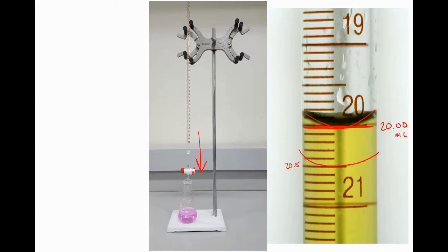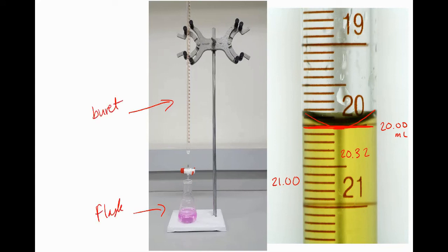And then last thing on sig figs, because a burette reads to the tenths place, that makes it a very precise tool. So whenever you're taking a reading from a burette, you'll want to record your values to the hundredths place. So instead of saying 21.0, it'd be 21.00, or if we were saying 20.3, 20.32, you just want to make sure to have at least 2 decimal places there. All right. But again, in the lab, you'll have your burette up top with the titrant. You'll have your flask down in the bottom with the analyte. And I think they're going to be having you all in the lab kind of help with an acid spill, I think.